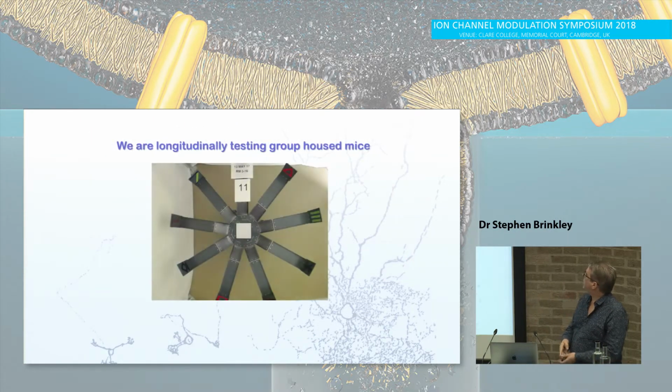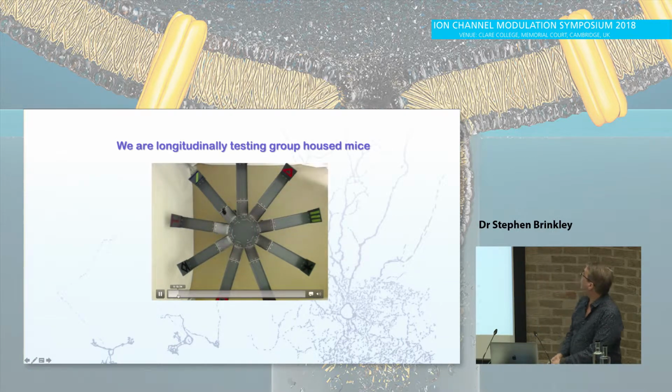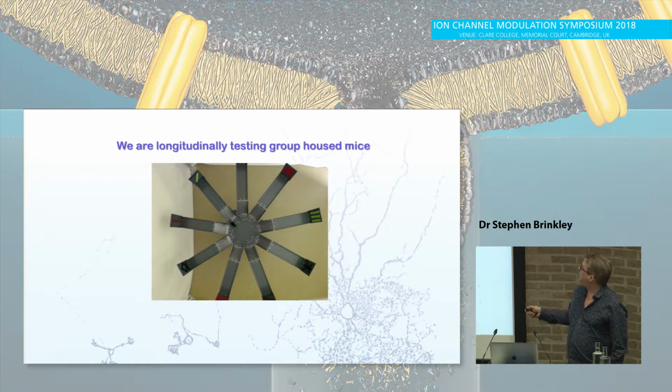So first of all, this assay, where's my mouse? I'll just jump ahead to show you our assay. It's a 9-arm radial maze, made slightly more difficult. This ramp is a platform it's got to walk up before the mouse can see a visual cue at the end of the arm. It's a foraging task. They've got to find food at the end of each arm. This mouse has been doing it a while, because I can tell, because it's going up and down arms. So it knows there's food there.